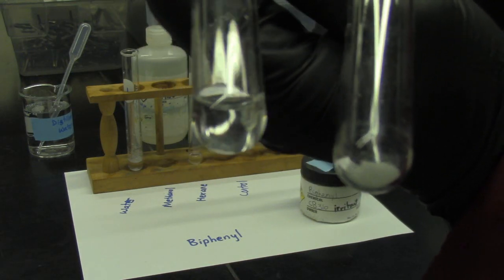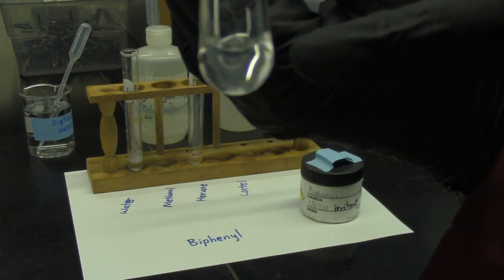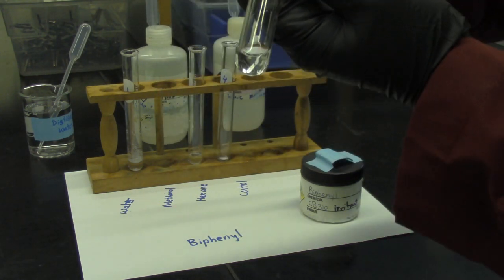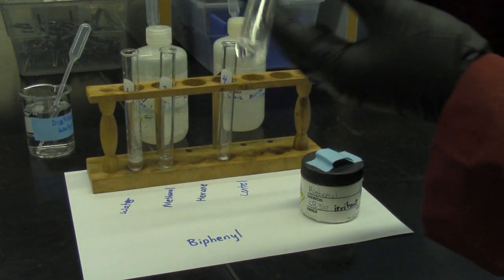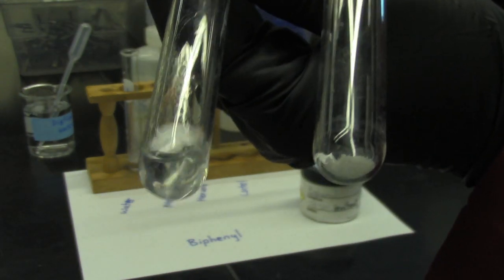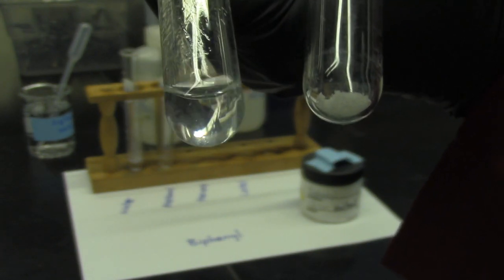Compare with the control. You will see a little bit of biphenyl at the bottom, but less than the control. Number 3, hexane mixed with biphenyl. After 1 minute, you get this. So write down the observation.